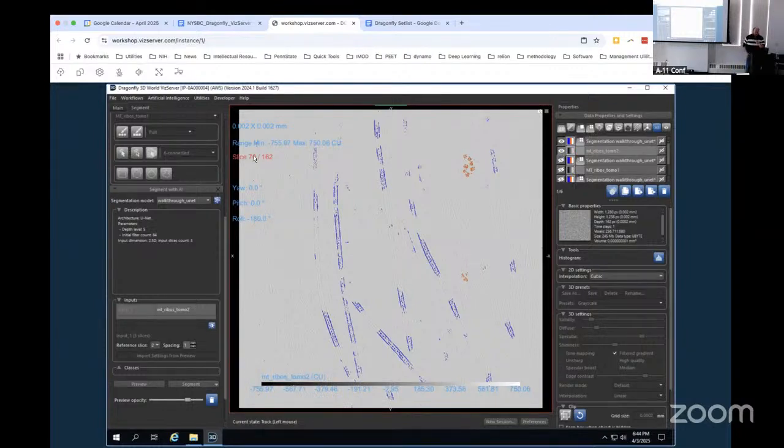All right, go ahead. Click on the leading edge tomo or on the tomogram itself. You have all my notes.